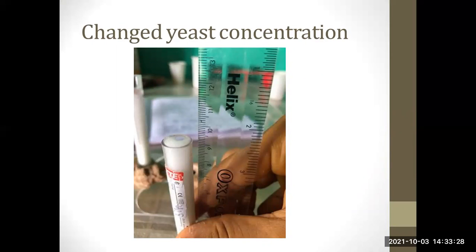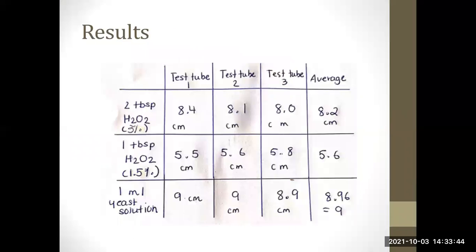So what happened is that I noticed that the foam was very, very fast, and it went up very high. See, it almost overflowed the test tube, to about 9 centimeters. So this was my result overall.